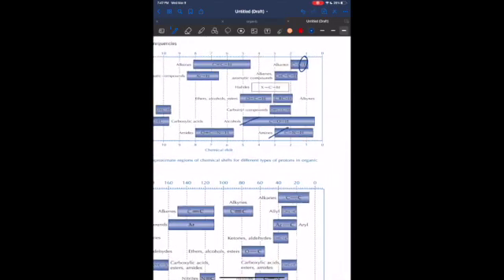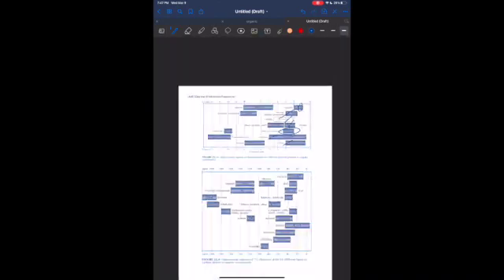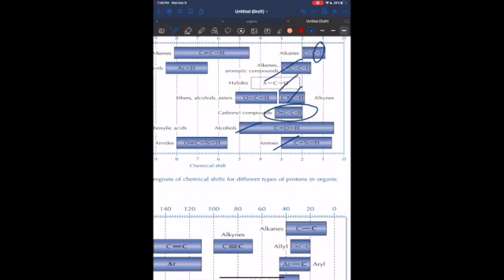Next, we can see that around 2.2, again, it's not going to be an amine, not going to be an alcohol. We do have a carbonyl in ethyl acetate, so that's what I'm going to look for. There's no sign of any alkynes, no halides, and it wouldn't be part of an aromatic ring or any carbon double bonded to carbon. Lastly, we have one at around 4.1, which we can see is probably, again, not an alcohol, but sitting at the ether, alcohol, and ester peak.